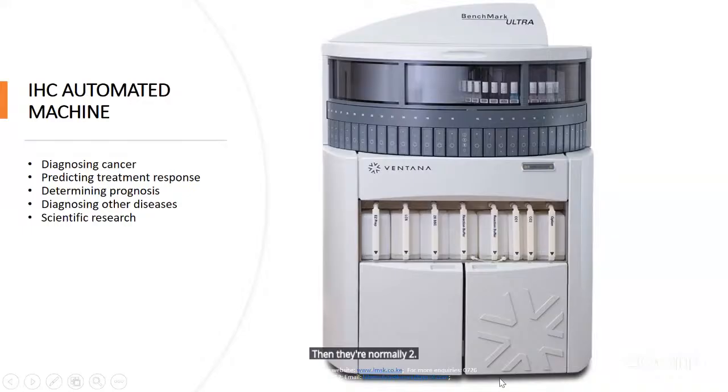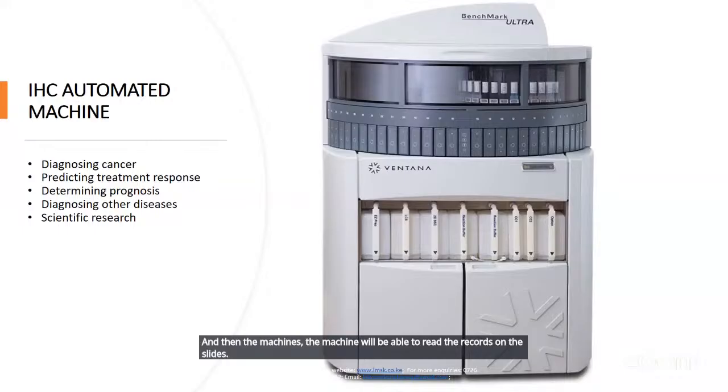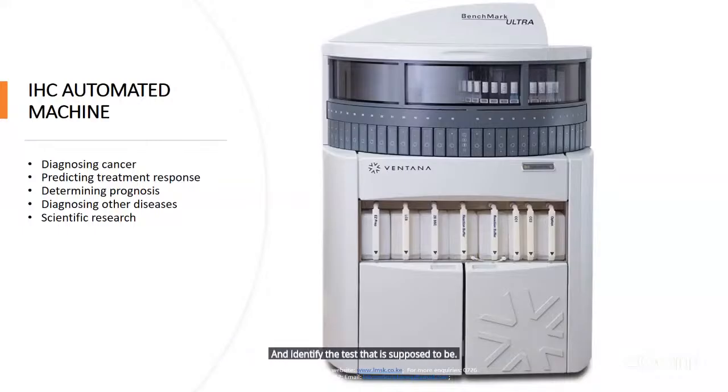And then this particular machine works together with a screen, and you have the barcode printer that you print your barcodes on and stick on the slides. And then the machine will be able to read the barcodes on the slides and identify the test that is supposed to be done.